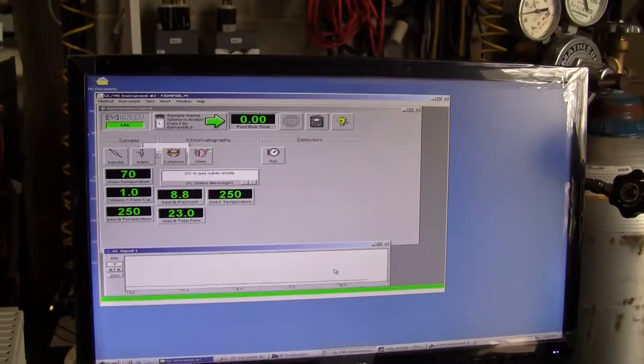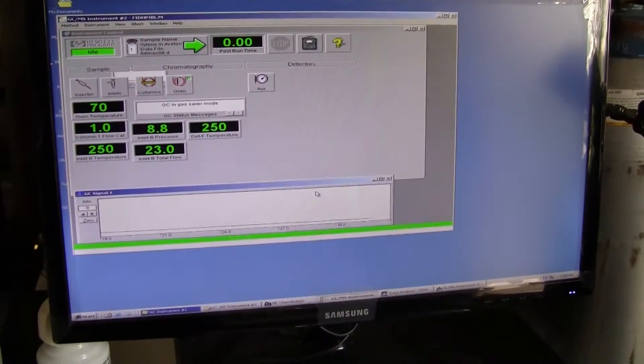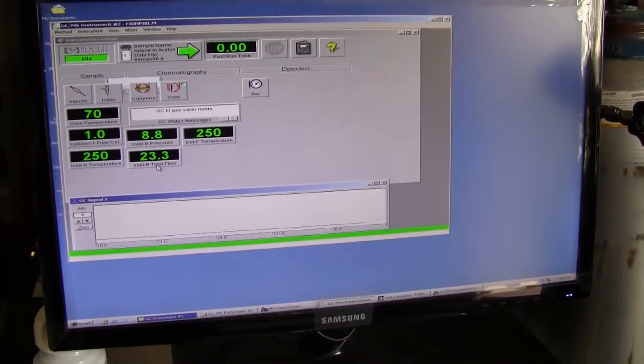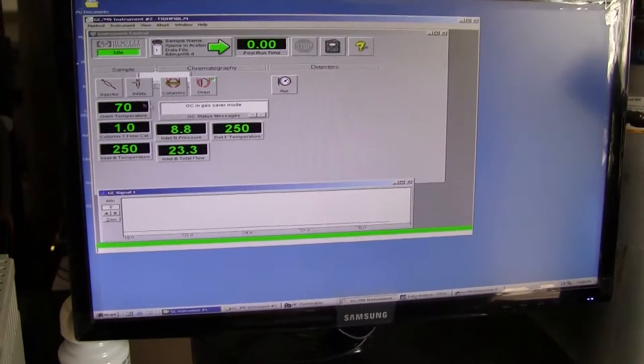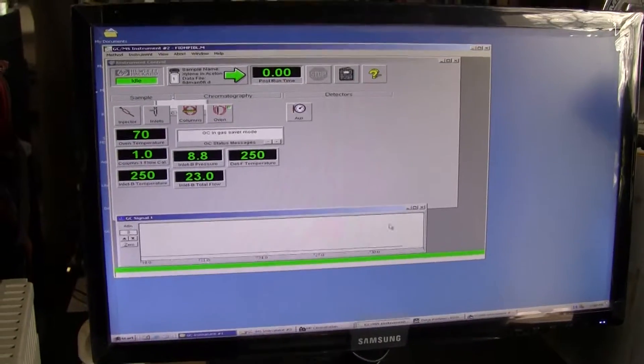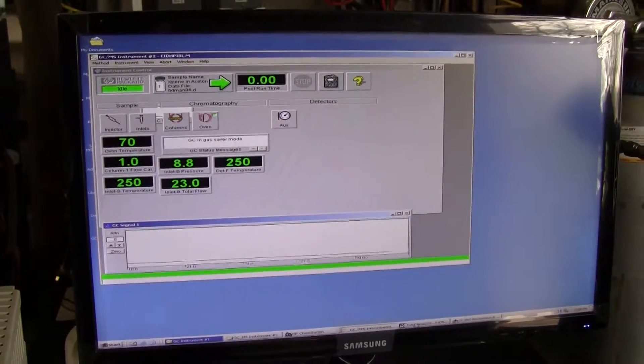We just wanted to show you the brief run after that injection we just did. We have inlet flows and pack pressure, it's communicating fine.